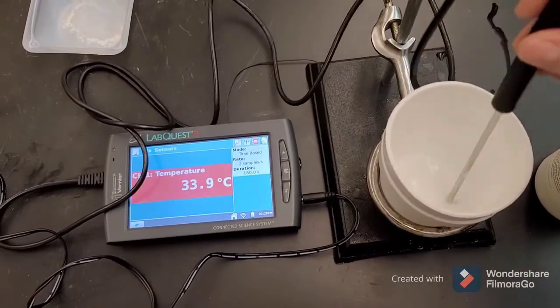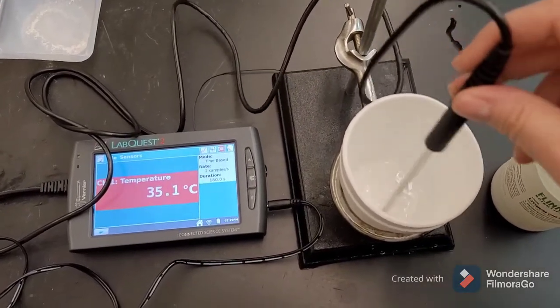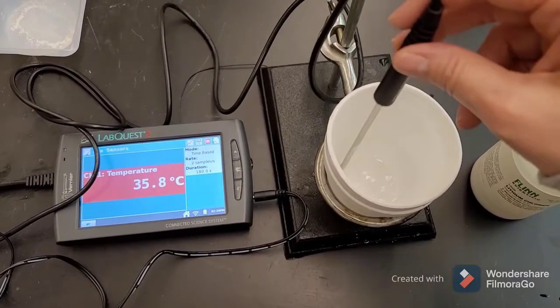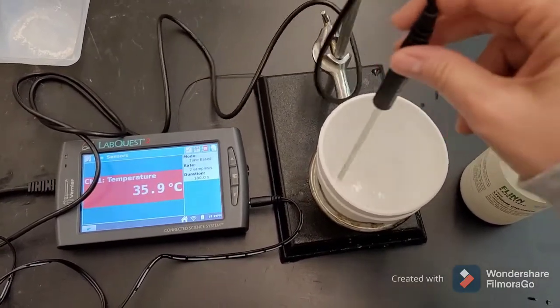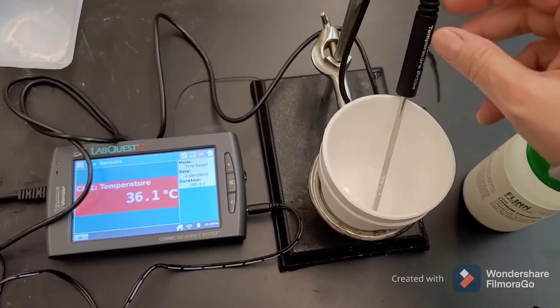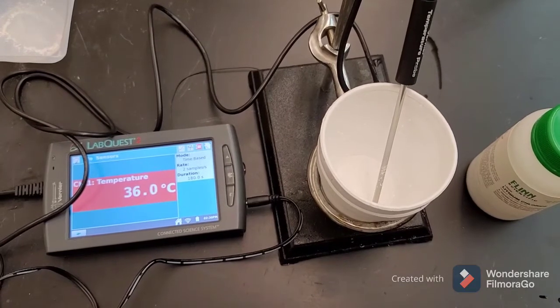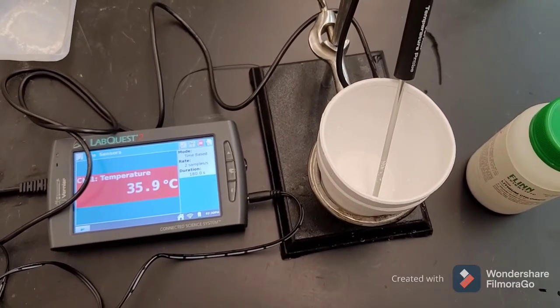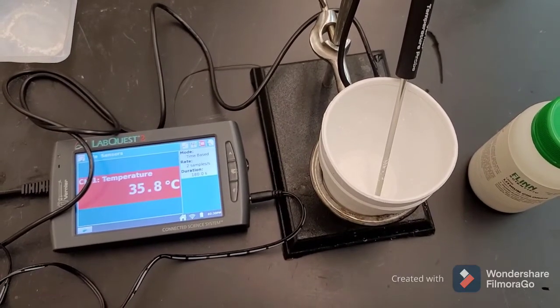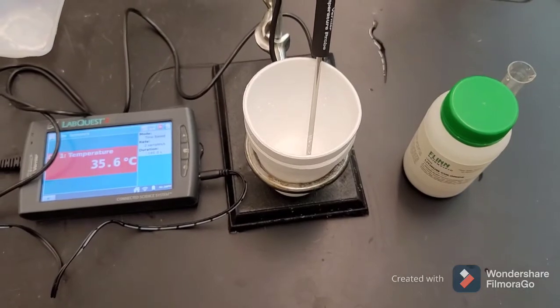And again, we'll just record our highest temperature that we see once the heat of the reaction is done. And then you need to use the data that I'm going to email to you once you ask me, to make a rule so that I can predict for any chemical if it's going to be endothermic or exothermic. So it looks like our highest was 36 or 37, and this was getting hotter.